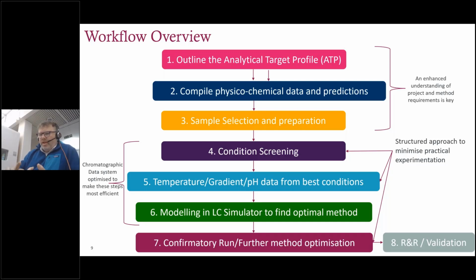And this is about understanding the analytes that you want to analyze for, and where in the development process that method is, or where it needs to be amended or created. Is this very early in development within the pharmaceutical industry, for example, or is it nearing that commercial facing method that is almost now fixed in stone to some degree? So how do we understand its key impact on where that method needs to operate?